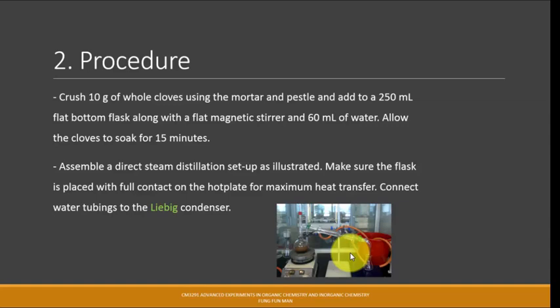You have to check again, level your eye at the bottom of the flat bottom flask and see there's really no gap. You should place the flat bottom flask first, make it settle, and then slowly secure the boss head. Do not adjust the boss head and force it down thinking that it is all in full contact. It may take you more than 3 hours, then you can't finish.